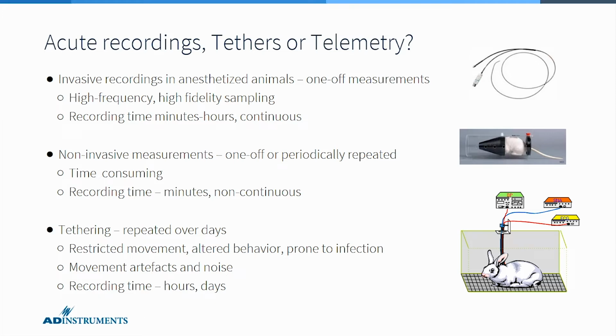So rather than waveform data that you'd otherwise collect, you're maybe getting 1 or 2 blood pressure values for the recording time. So these are quite valuable for screening large numbers of animals or a colony of animals, to make sure that it's either a colony where you might want them to be expressing hypertension, or checking whether hypertension is developing in that colony over time. But it's quite difficult to collect publishable data with these systems, I think, because of the amount of training and time that's involved in using these systems.